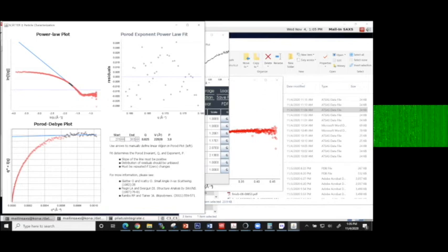And the reason that's useful to write down is later on you're going to generate shapes. Often you're going to generate shapes in an EM-like rendering program, and that allows you to have a level of contour. For each contour, you have a volume. So you can adjust the contour of the EM map to be equivalent to this value, and that gives you a more accurate way of getting your volume, your contour. So that's that.